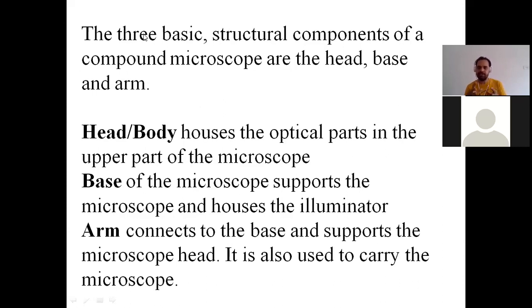So every instrument you should be able to handle properly. Suppose you have to shift the microscope from one place to another place. As I told you, from the arm portion you can pick it up and transfer it. A compound microscope, obviously, at times is very heavy and costly also.